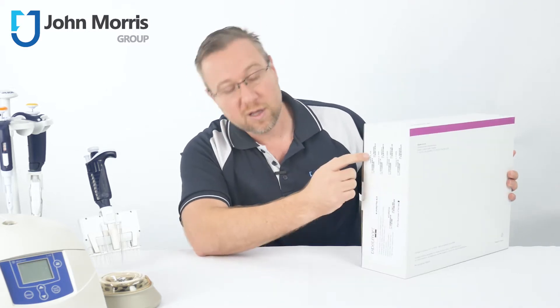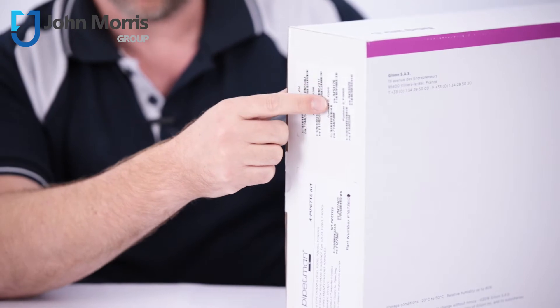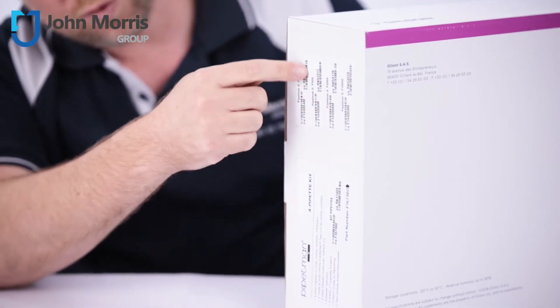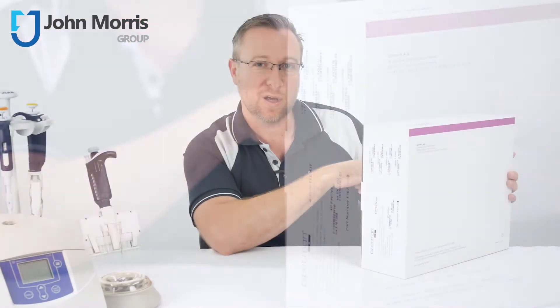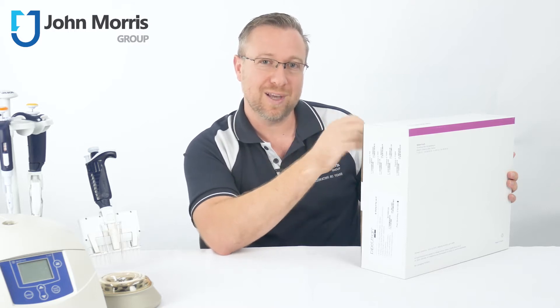Also, when you look on this side, you'll see there's a number of barcodes for the individual pipettes that you've got. Each pipette is individually calibrated, so it's important that these barcodes here actually refer back to the correct pipette which is inside, and that means they can track and trace the pipettes going into each kit.